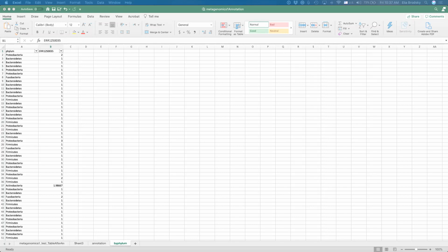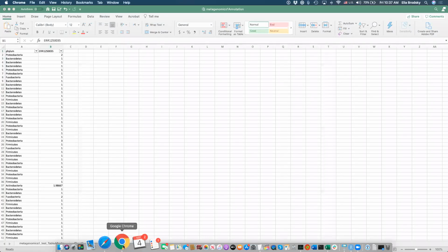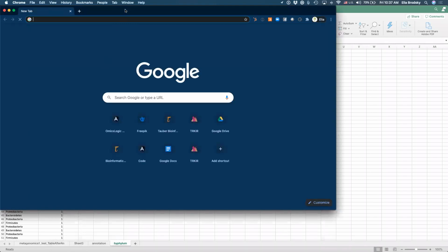Okay, so this is the actual file. Anyone can download it. Okay, so once we have this file, let's see what's inside.